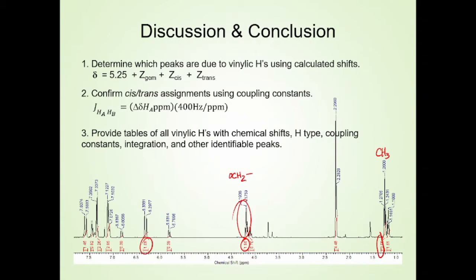So bonded to a methylene. So these are bonded to each other. So you should be able to identify that. And that, of course, would be the ethyl ester portion.